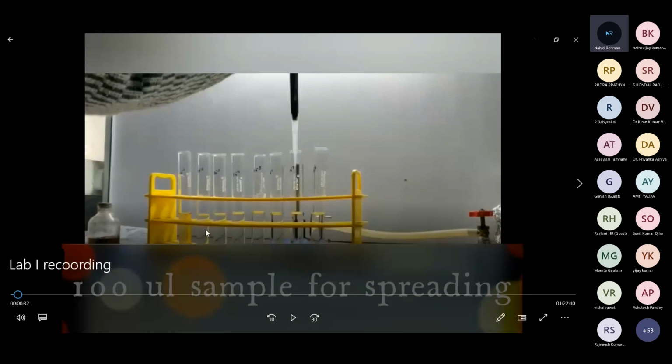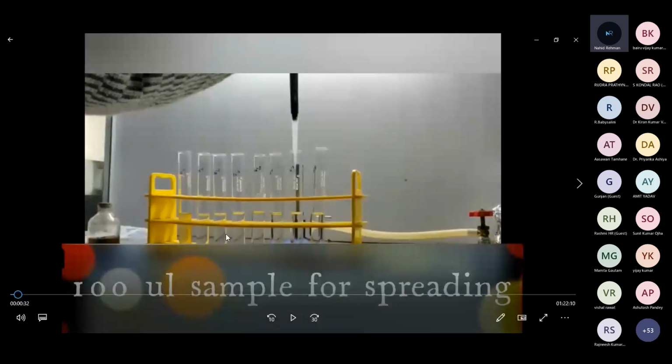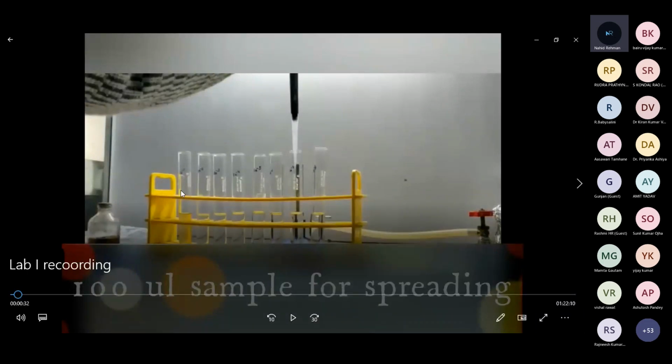As you see, there are different tubes. In all those tubes, the buffer has been kept, either simple phosphate buffer, or you can take saline. Saline will help the microbe not to get any osmotic shock, and buffer also plays the same role. So whenever you are taking the effluent and diluting it in the saline, it is in tenfold dilutions at every step. Suppose in the first tube you have taken 1 ml of the effluent sample and 9 ml of water, so total it is 10 ml. Mix it properly and then transfer 1 ml again to the next tube.